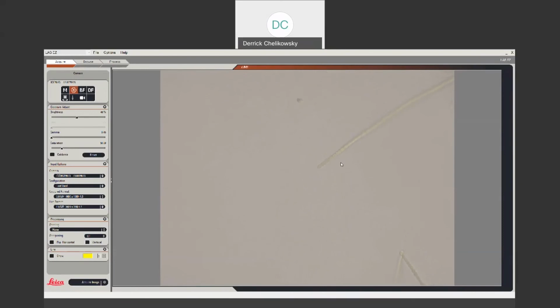I'm not going to try to do oil immersion with this. The large cells, I mean, I could see more, but I don't think that I'm going to have very much success. I'll probably try to do it off camera and see what I get.